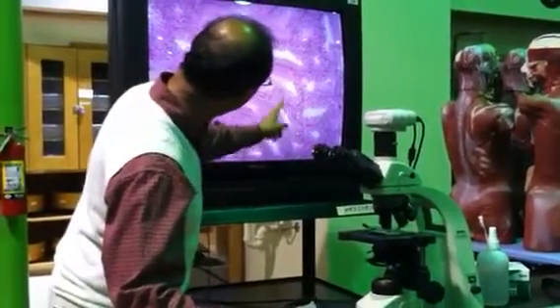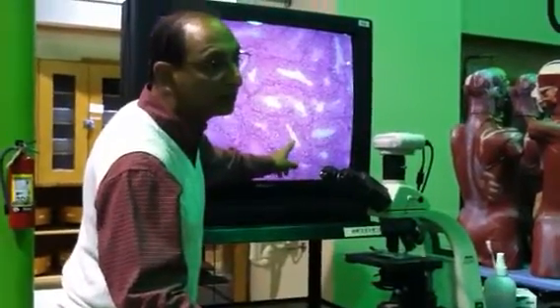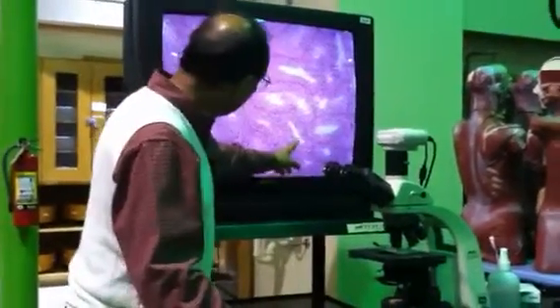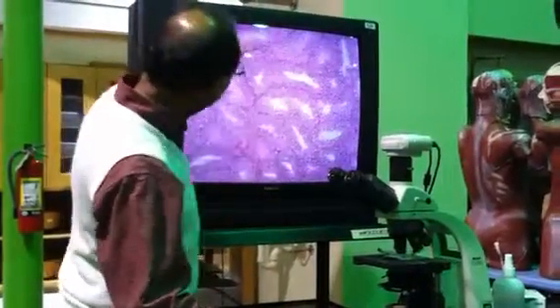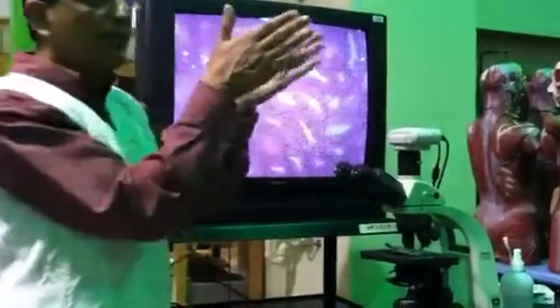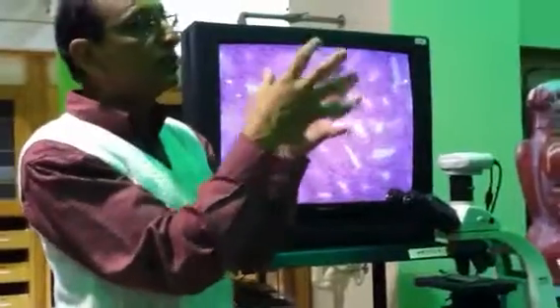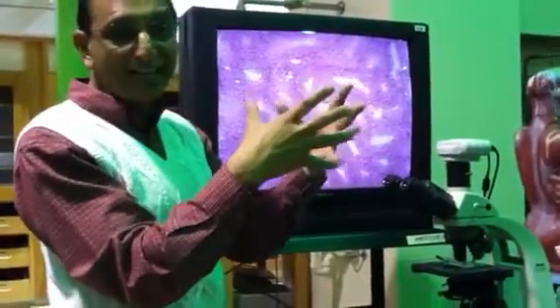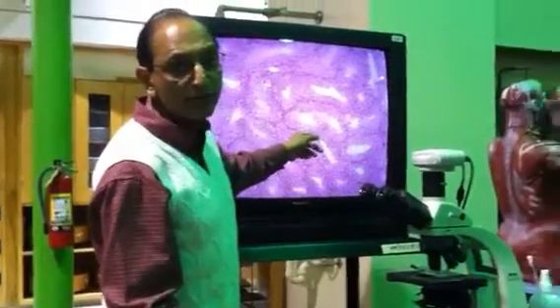See the lumen there? So sperm will be near the lumen. And outside this tubule will be interstitial. But in this slide, the tubules are very tightly packed. In some other slide in some other tray, you may see tubules separate. They will look like eggs. But look at all the cells here, germ cells here.